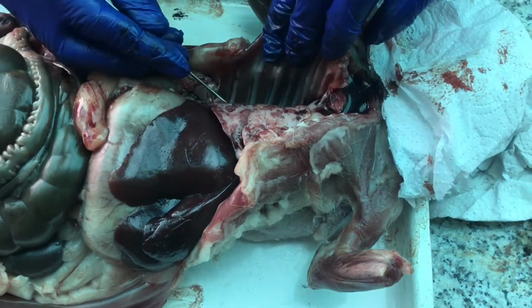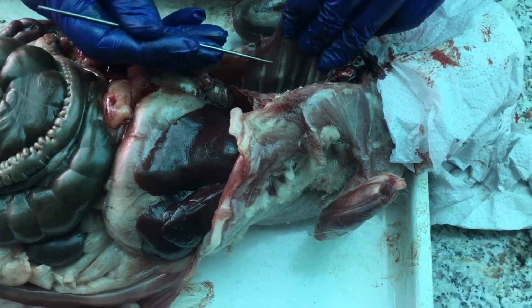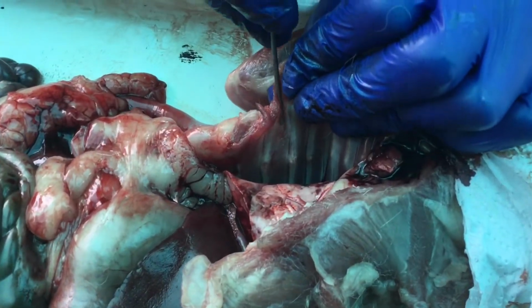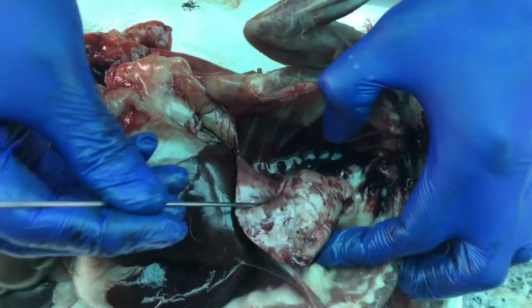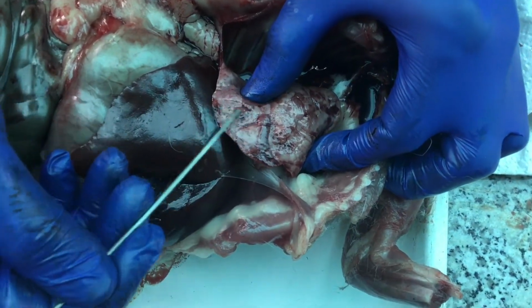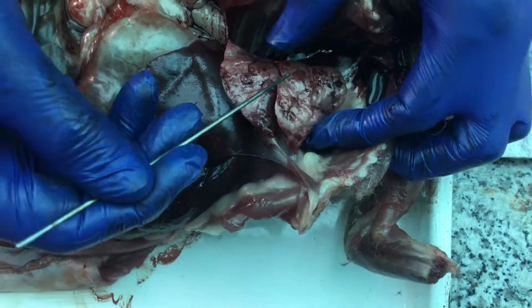And here's the internal surface of the ribs, where you still see that same serous lining. In this case, because it's in the outer somatic or parietal part of the body, it's the parietal pleura. Because we're in the chest cavity, I can get my probe just under there, and I've got parietal pleura lining the internal surface of the ribs. And then on the lungs themselves, remember the lungs form the visceral part, the internal organs, again very tightly adhered, but you can see how there's a sheeny layer on there. I've got the visceral pleura in this case because I'm in the pleural or chest cavity.